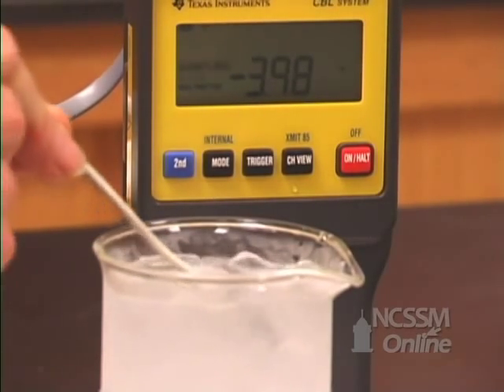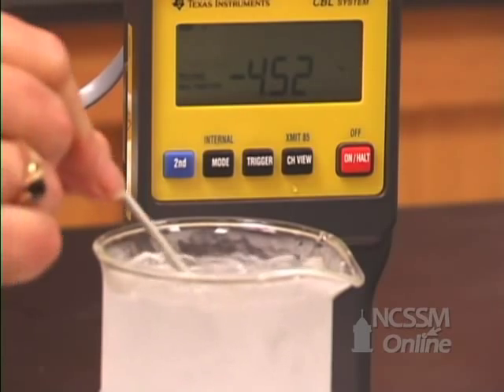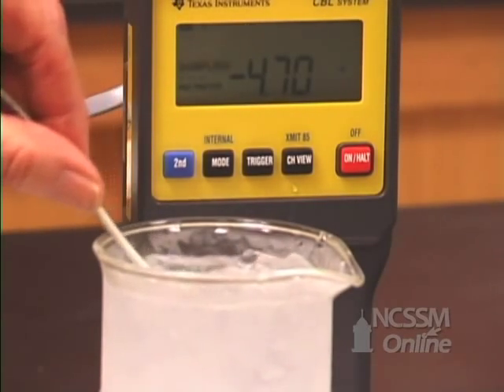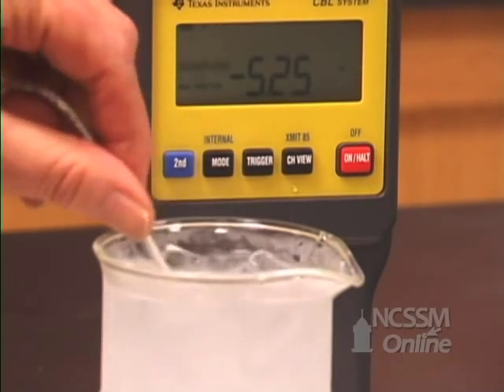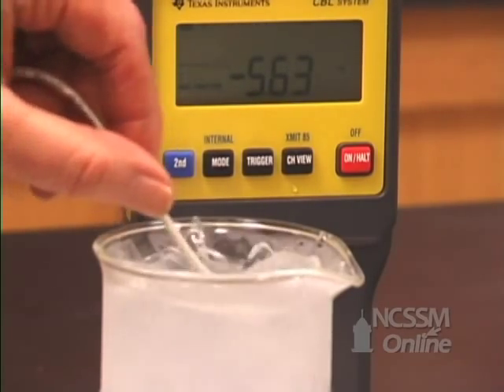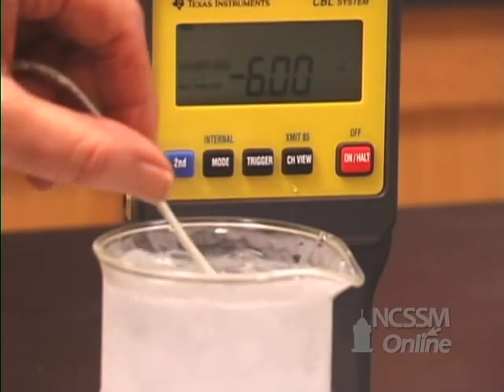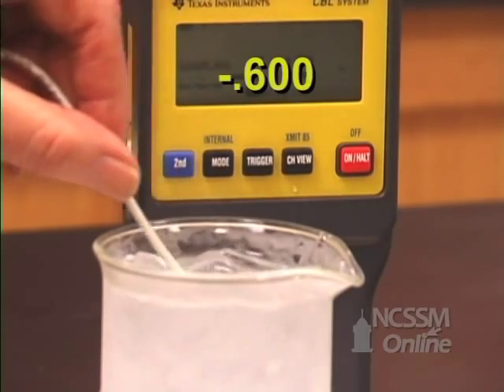You can see that we have lowered the temperature — by 4.3, 4.5, 4.7, 5, 5.63, 6 degrees. So we were able to lower the temperature by 6 degrees by adding the salt.